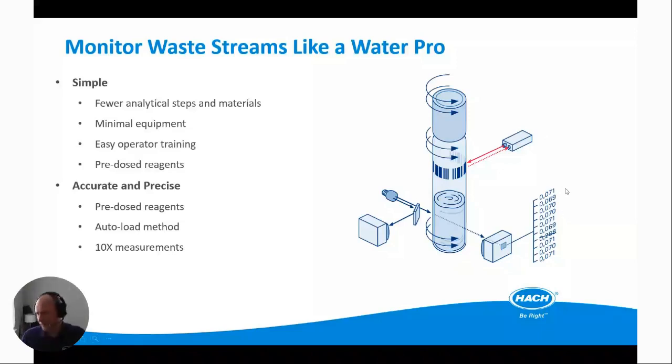So in this diagram, this looks like the 6th measurement here is 0.288, which is significantly higher than the others. And so the instrument will throw that result out because it knows that that is a statistical outlier that might be associated with a scratch on part of the vial or a fingerprint or something. Those were sources of imprecision in the previous method, but with the TNT plus vial and the way that it rotates through and averages out those values, that source of imprecision has been removed.